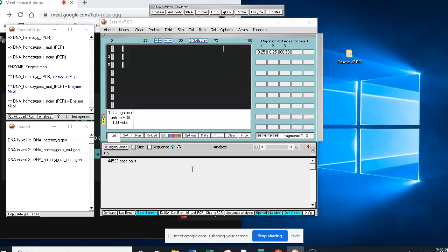So this is just the DNA that we started with. I don't know where this band came from. But notice how it's super huge, because this is where we loaded it, and it's running left to right. And the genomic DNA is really big because it hasn't been cut with anything, so it doesn't go very far.